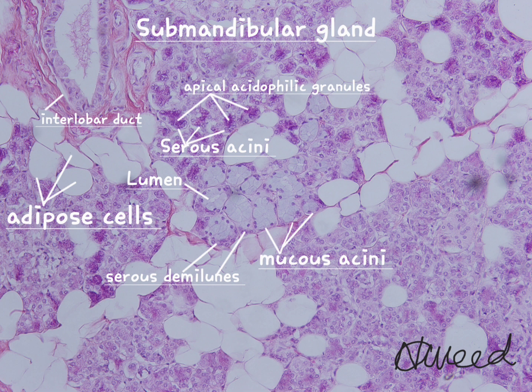The mucous cells secrete mucin, which is a strongly hydrophilic glycoprotein. Upon contact with water, the mucin becomes converted into mucus, which is a gel-like lubricant. The ducts of salivary glands are classified into the following three types: intercalated ducts, striated ducts, and excretory ducts.